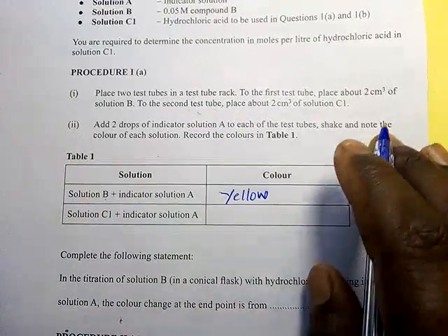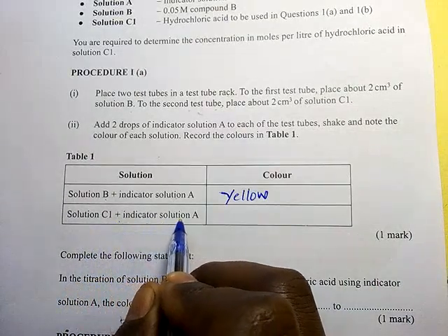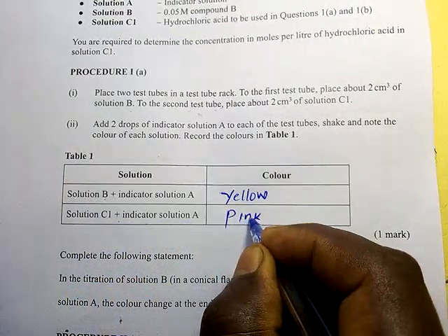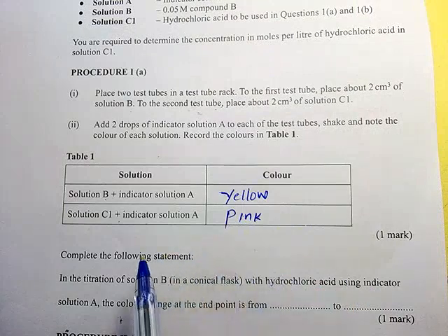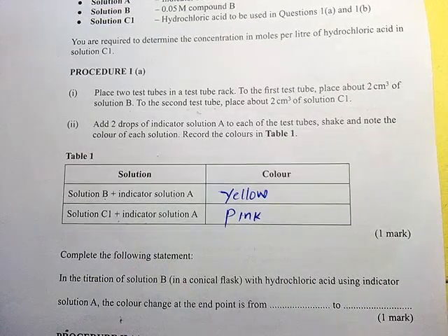So the students needed to write what they see, the observation. Solution C1 plus indicator solution A, the color was pink. You should note the color of indicators in different solutions. If the solution is an acid or a base, different indicators, like phenolphthalein and methyl orange, change depending on the solution. So you should know that.